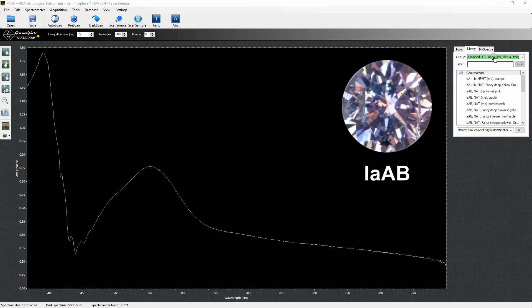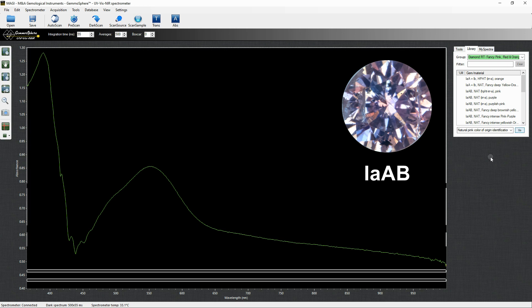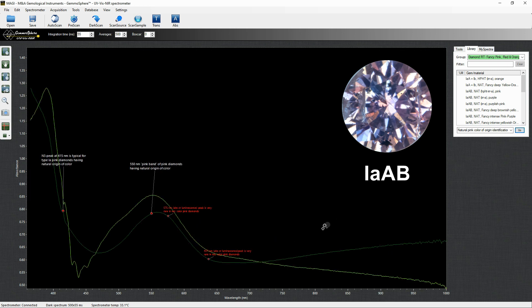In the pink diamond section of the database there is an application displaying critical information on how to identify the spectrum of a natural pink diamond.